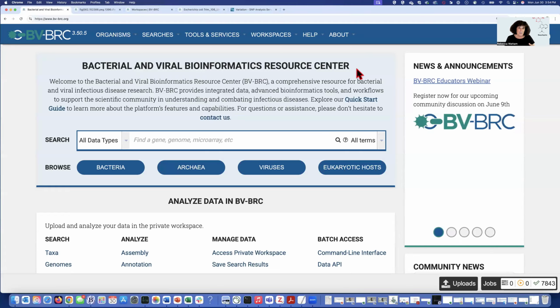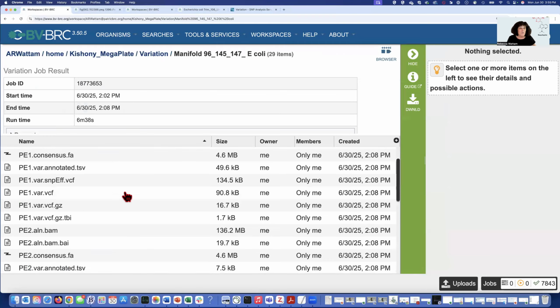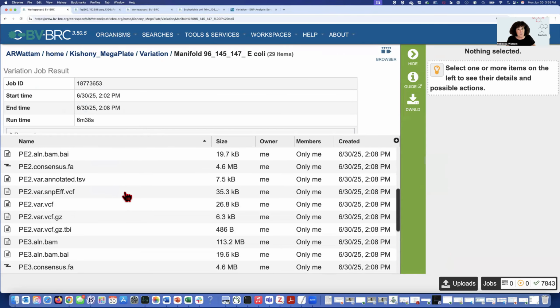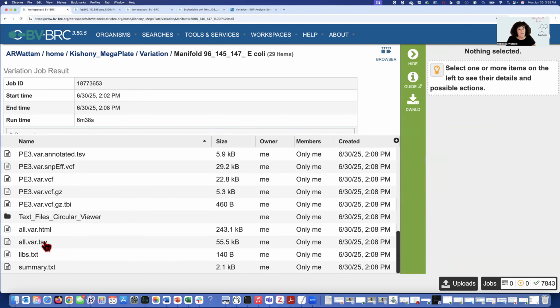In that last job, we submitted 3 run numbers against a genome to look at the SNPs. And in the last video, we looked at all the files that come as part of that job. We went to jobs and I opened up this particular job and there were a bunch of files and we stepped through all of them. I would encourage you to look at the tutorials in case you have any questions about those. In this particular video, I wanted to focus on the TSV file for the variants.